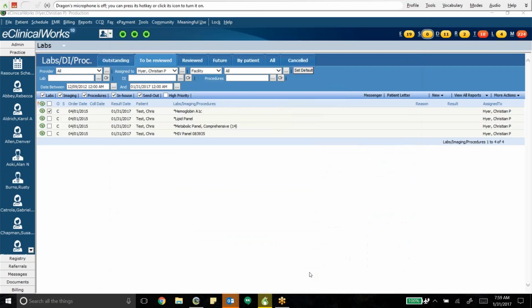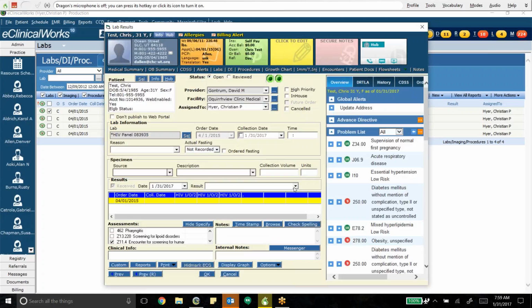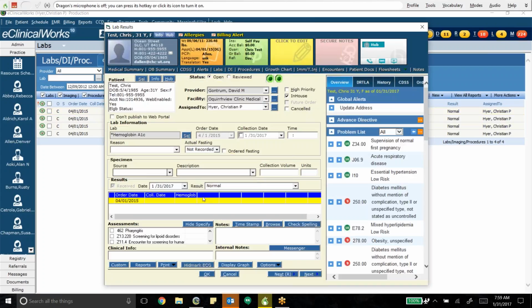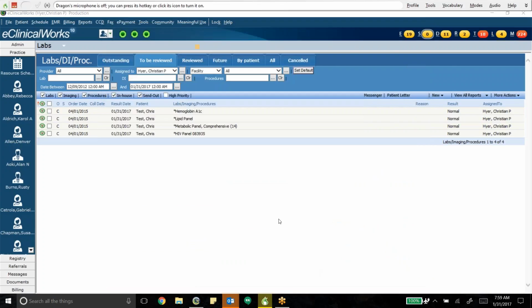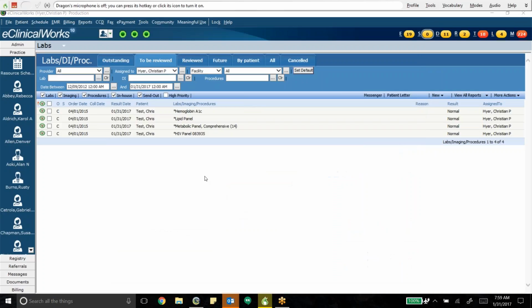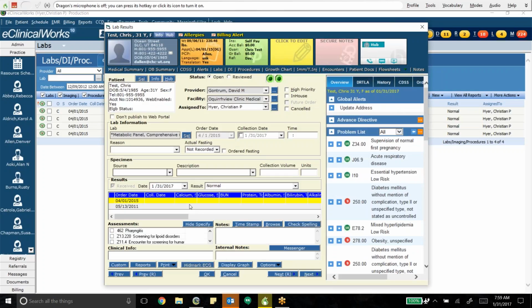And so once I throw in a result on each one of these, I wonder if my cumulative view will now show. I may actually also have to have something along these lines in the actual result fields in order for that cumulative view to show up for you. Let me just throw these in here.